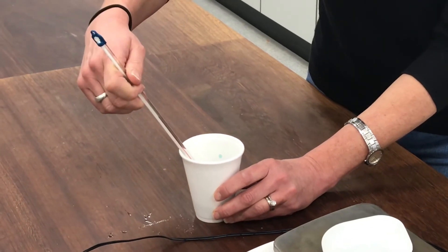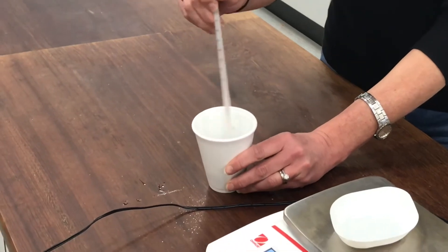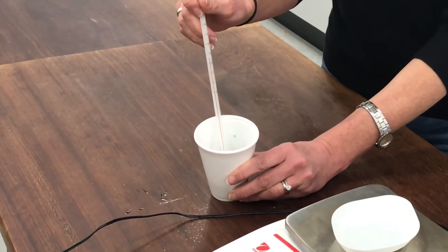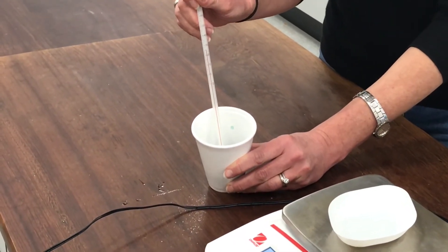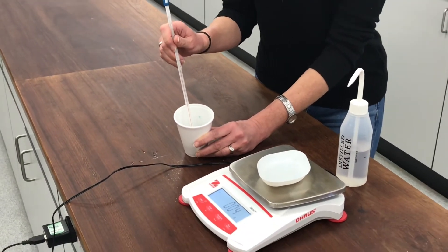The temperature is on 26 degrees now. So you might like to have a think about whether this reaction has been exothermic and released heat energy, or endothermic and taken in, used up heat energy.